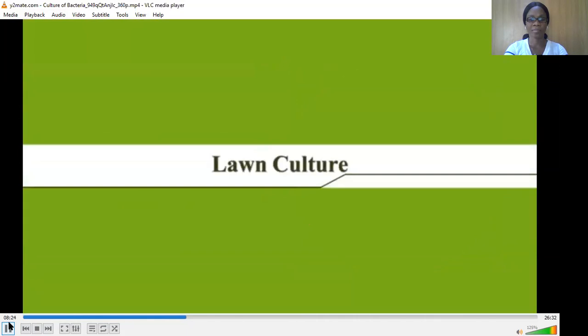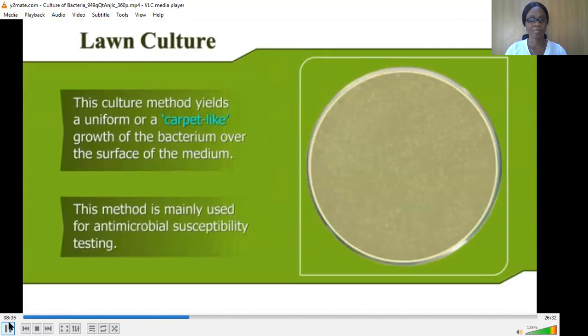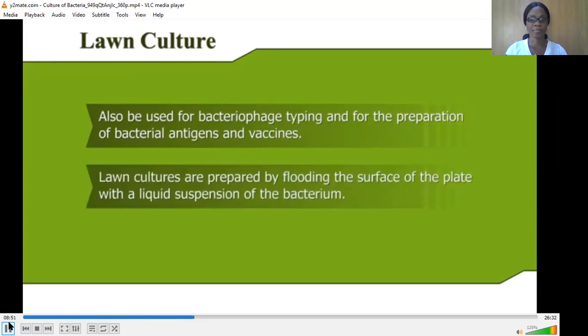Lawn culture. This culture medium yields a uniform or carpet-like growth of the bacterium over the surface of the medium. This method is mainly used for antimicrobial susceptibility testing. It may also be used for bacteriophage typing and for the preparation of bacterial antigens and vaccines. Lawn cultures are prepared by flooding the surface of the plate.